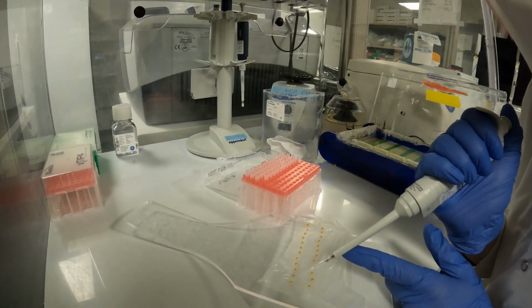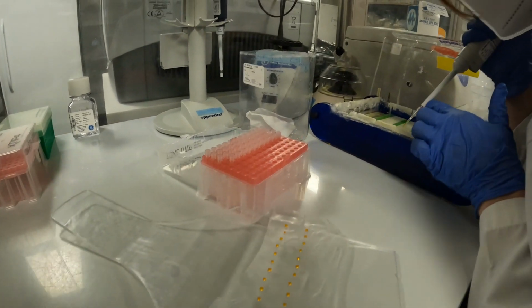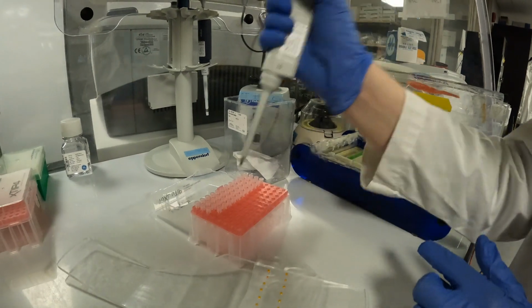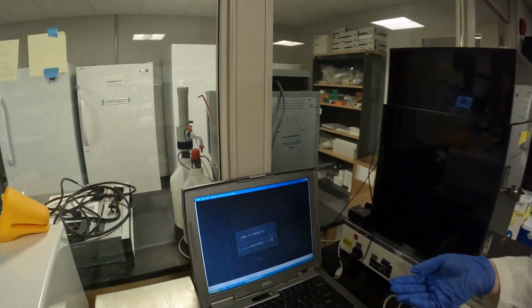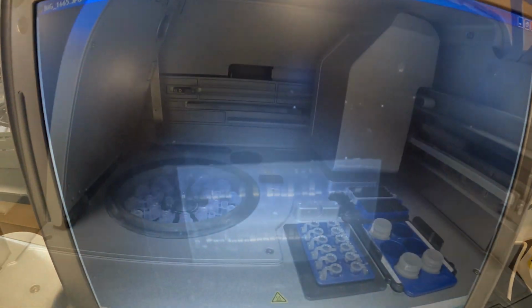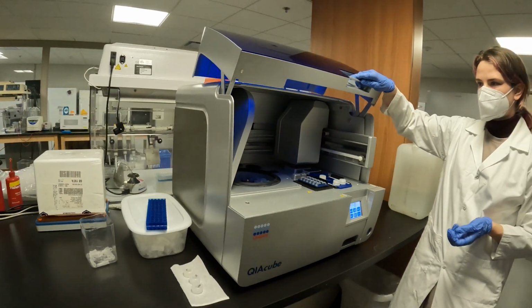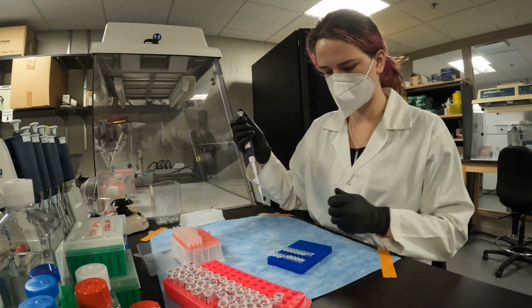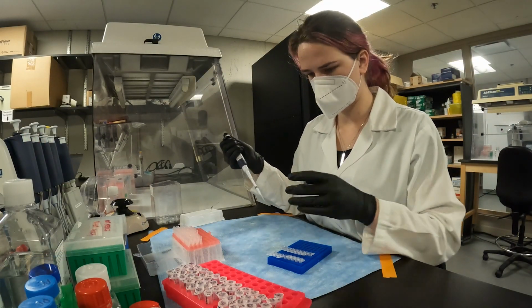Before we sequence the DNA, we confirm successful amplification using gel electrophoresis. We repeat the PCR step, but this time we tag the primers with special nucleotide sequences that help Illumina's MiSeq system recognize the sample. Purification further concentrates the DNA and removes any excess primers or reagents. Now the sample is quantified and normalized so that all samples are equally represented during sequencing.